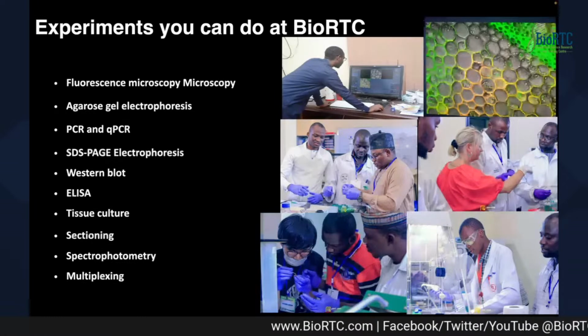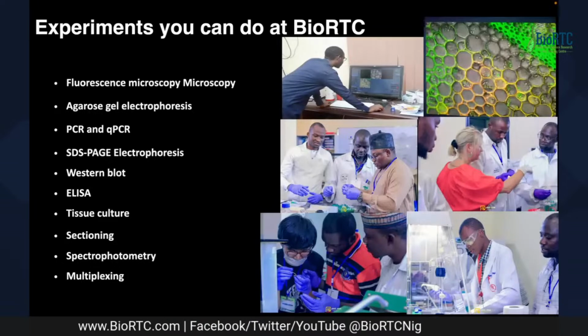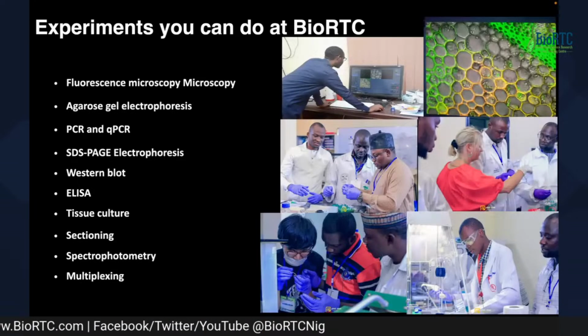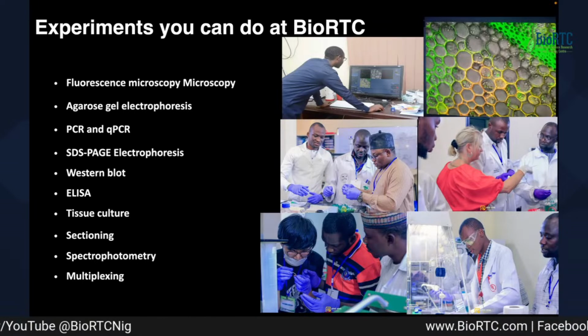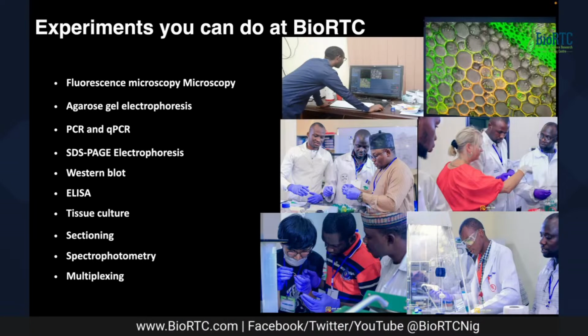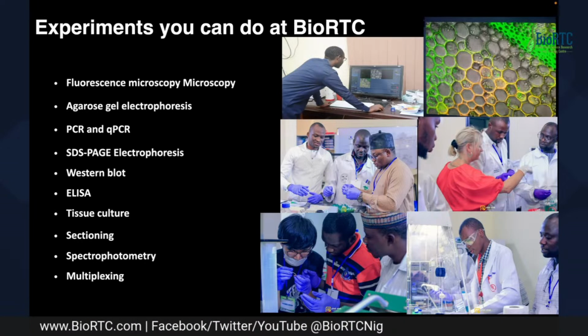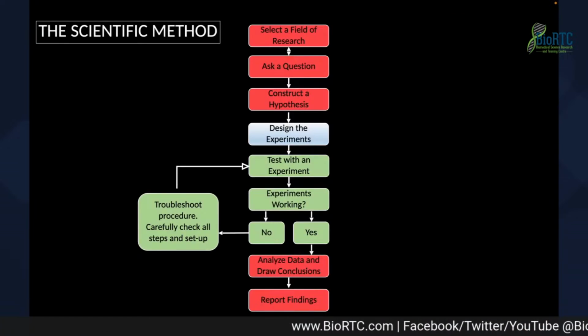Then, of course, agarose gel electrophoresis, PCR and qPCR, SDS-PAGE electrophoresis, Western blot, ELISA. All these are some of the techniques that, if you are to come to BioRTC, I'm going to tell you the caveat when you come. There are some conditions, of course, and some of the requirements to run it. But technically you should be able to run these assays in BioRTC.